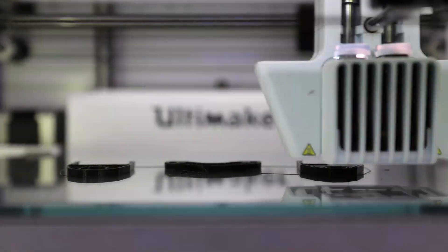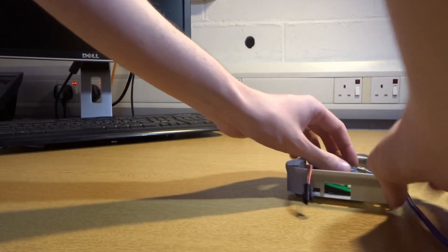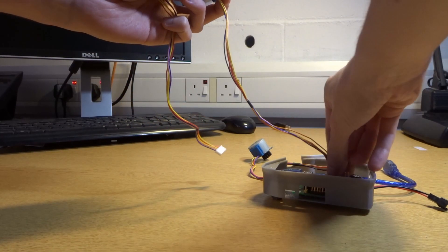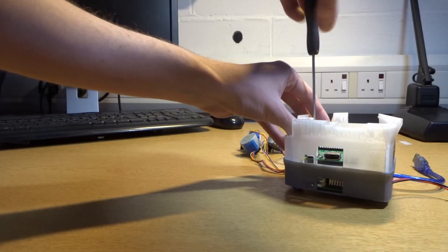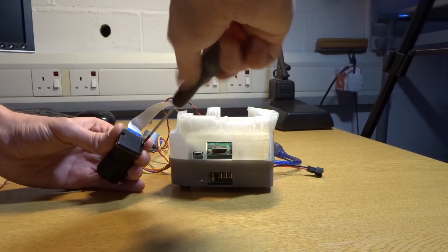The OpenFlexure microscope is an open source 3D printed microscope. It is built around a Raspberry Pi and a few other cheap and easily obtained components. Using common tools, the microscope can be put together in a matter of hours.